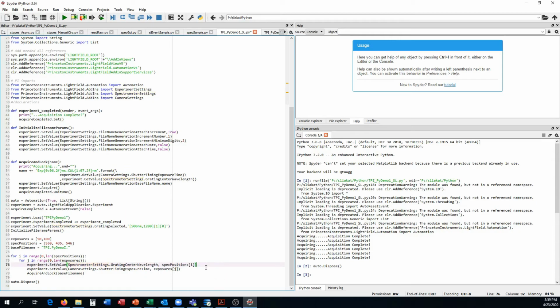And then we went through the event. The event is like a trigger. Like you have your hardware logic outs, here's your software trigger. So you have a listener that's independently listening the whole time for this. Right here, this experiment completed to have happened. The experiment completed happens, quote unquote, once the frame data has been updated for another frame.